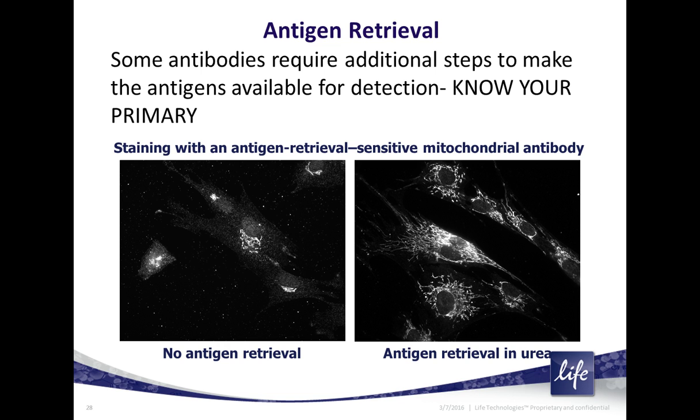Let me just take another quick moment to go over a couple more recent questions, and then I'll give a conclusion. To answer one question here, what kind of antigen retrieval is good for cultured cells without losing them? Antigen retrieval is less often used for cultured cells than it is for tissue sections, but it can still be needed. Most commonly, just a citrate buffer at 95 degrees in a double boiler is good, but again, it varies from antigen to antigen as to which method is best.